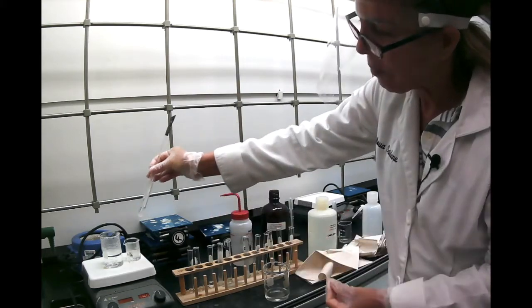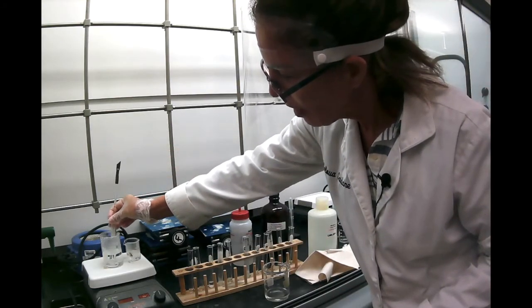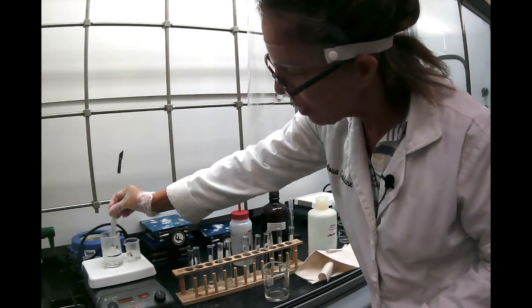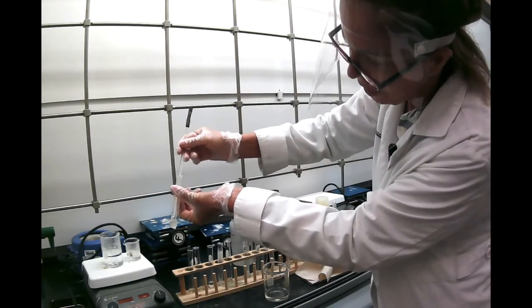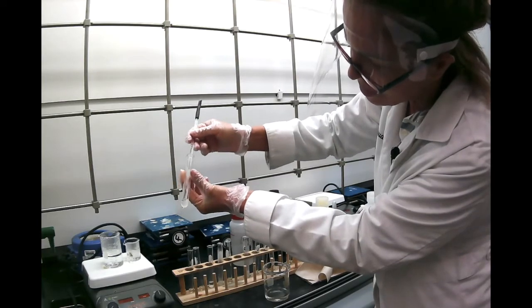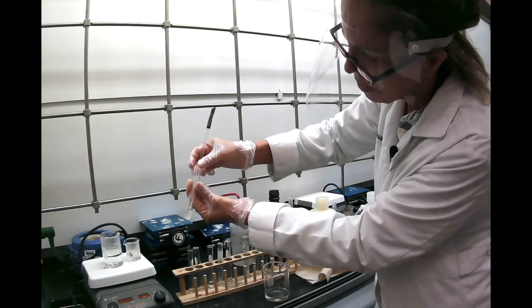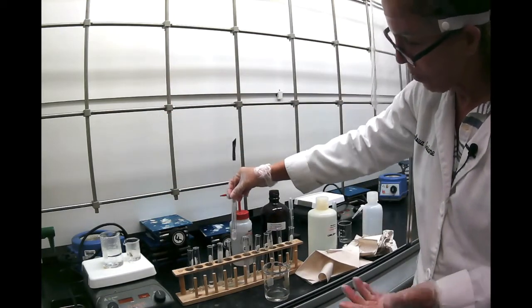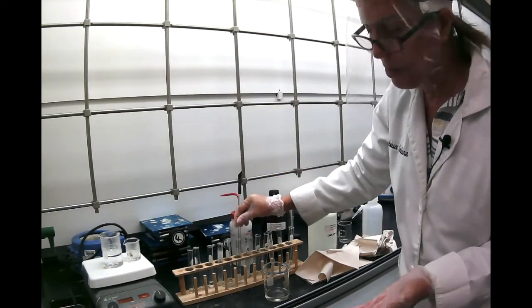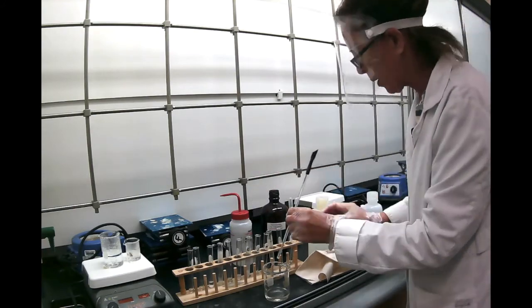So let's heat it up a little bit. And you don't want to overheat it because petroleum ether has a very low boiling point. And it looks like it's really dissolving there. So naphthalene is soluble in nonpolar solvent, which makes sense because it didn't dissolve in water.